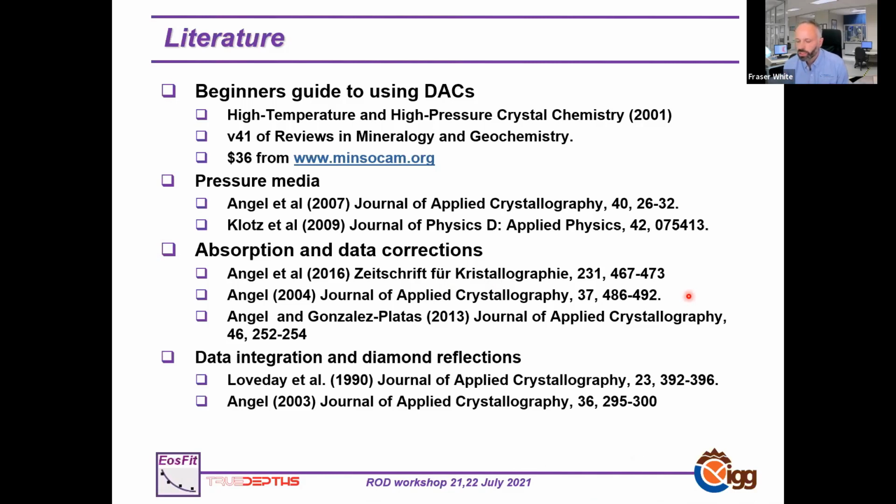So you were talking about the effective shading angle or psi angle. If you have not done a good job of aligning your diamond anvil cell body to the phi axis, Chrysalis works on the assumption that that cone shape is symmetrical. And if you've misaligned phi, this will not be symmetrical as Chrysalis sees it. And that means that this side of this shading here will be shaded and this side will not be shaded. So you'll have an effective lower opening angle if you misalign the cell on phi. So I just wanted to add that to what you were already saying. Absolutely. Thank you. That was a better explanation than I made.